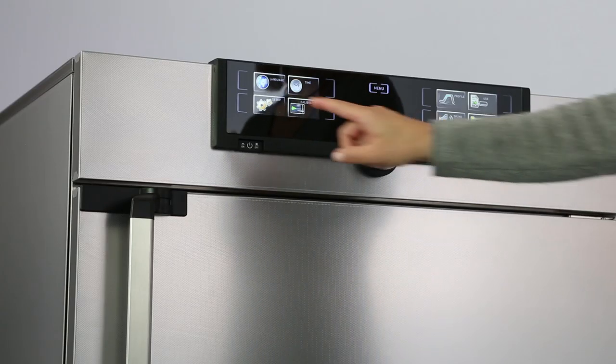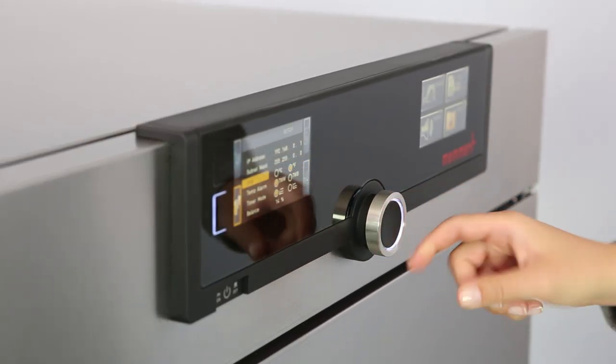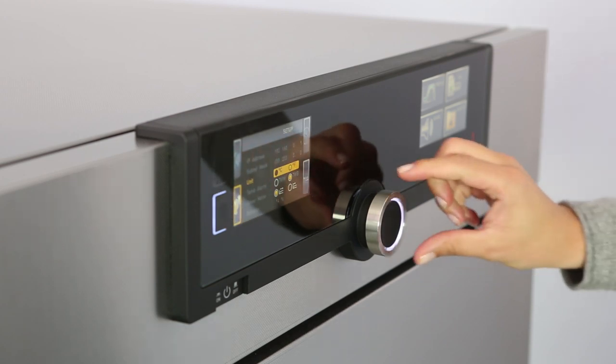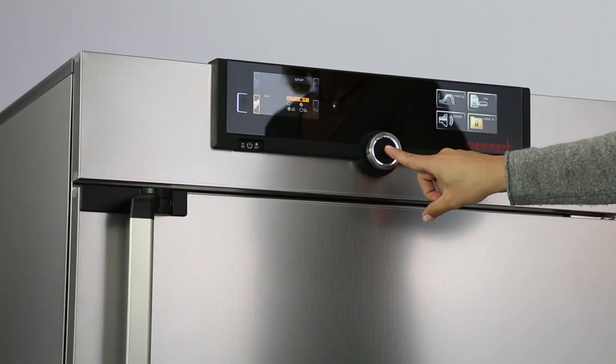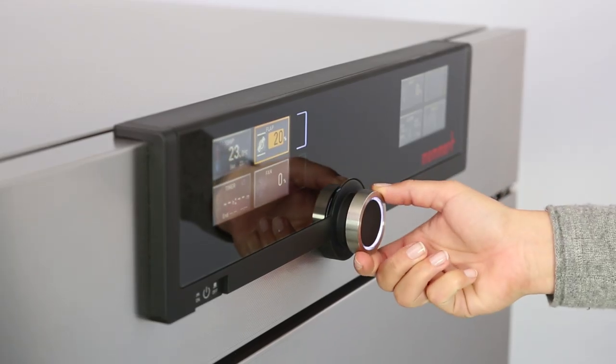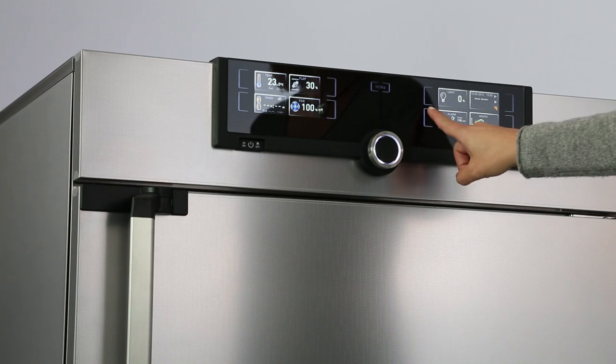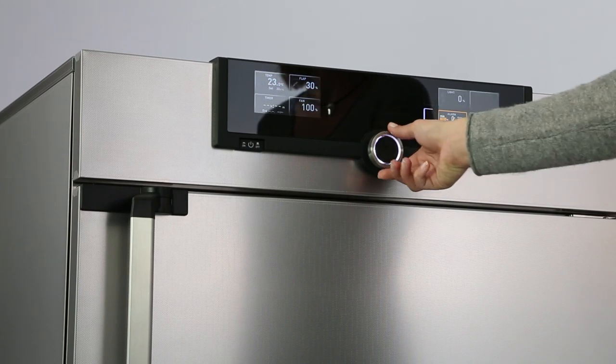Touch, turn and go — was it ever easier? To operate a heating oven, temperature, program, duration, fan speed, or ventilation flap positions are all selected in the left display for generation 2012 appliances.